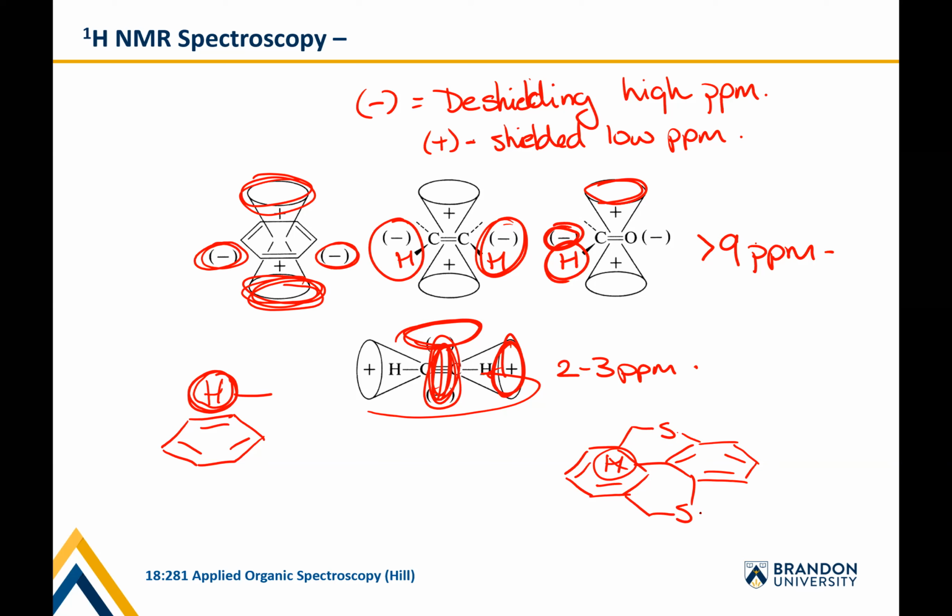It's basically, I'm missing a carbon here, two aromatic rings that were linked with some sort of heteroatom. It was sulfur and oxygen in my case. There are basically two different conformations of how these molecules could exist. One is sort of like a sandwich, and one is like a step, so to speak.